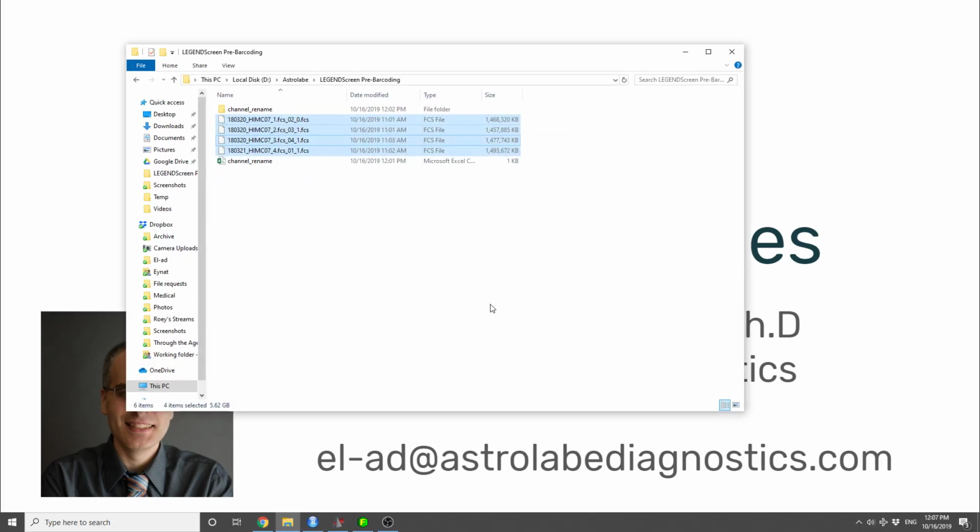So to show you an example, I took a few files from the Frontiers in Immunology paper that we published with Mount Sinai earlier this year. And these are 4 files that were acquired using a Helios machine. And they haven't been debarcoded, they haven't been touched in any way. They just came from the machine, got normalized, and that's about it.